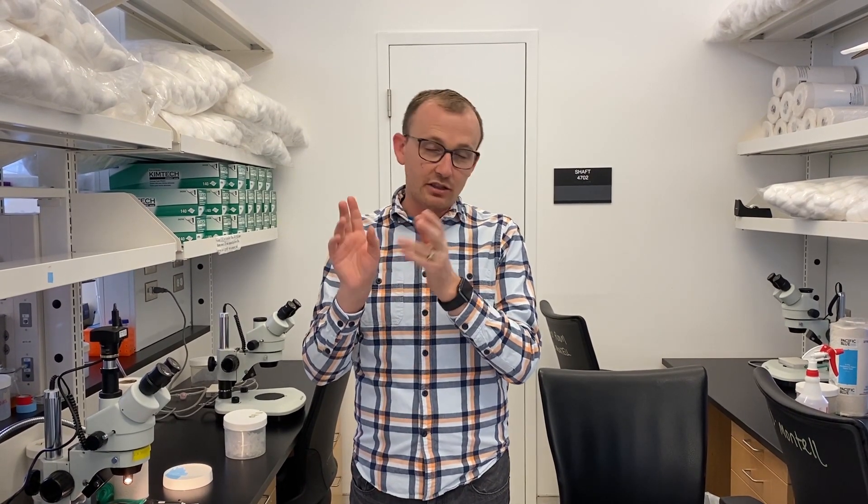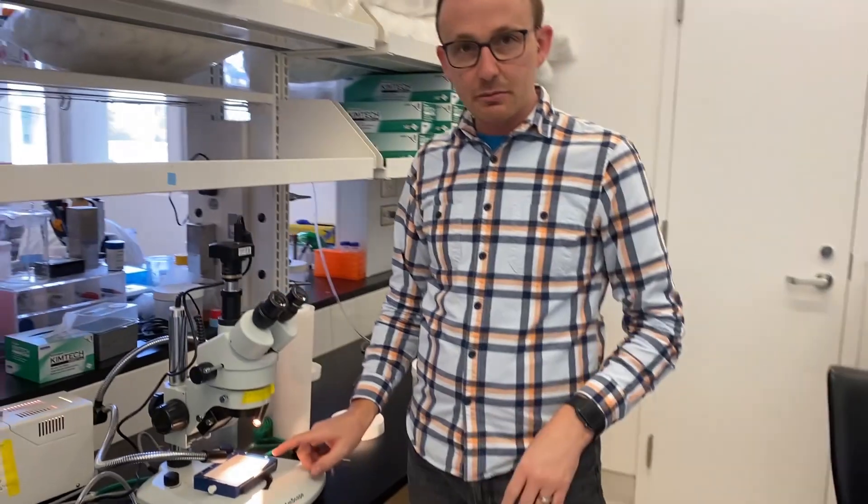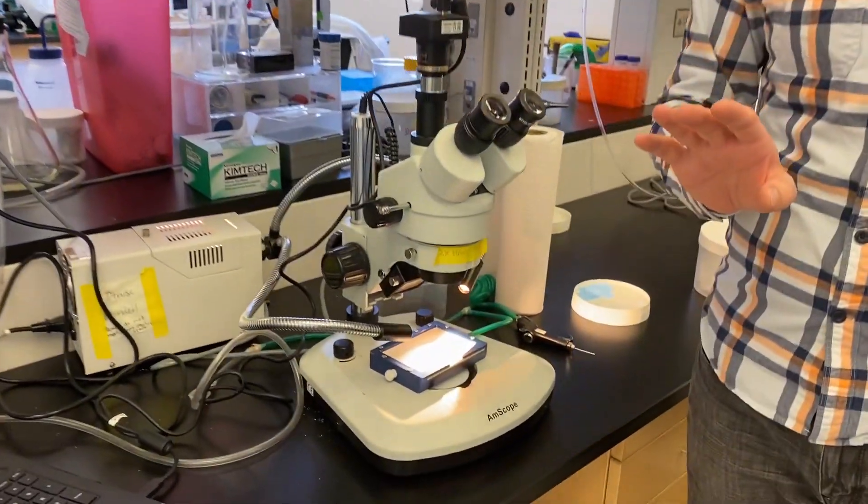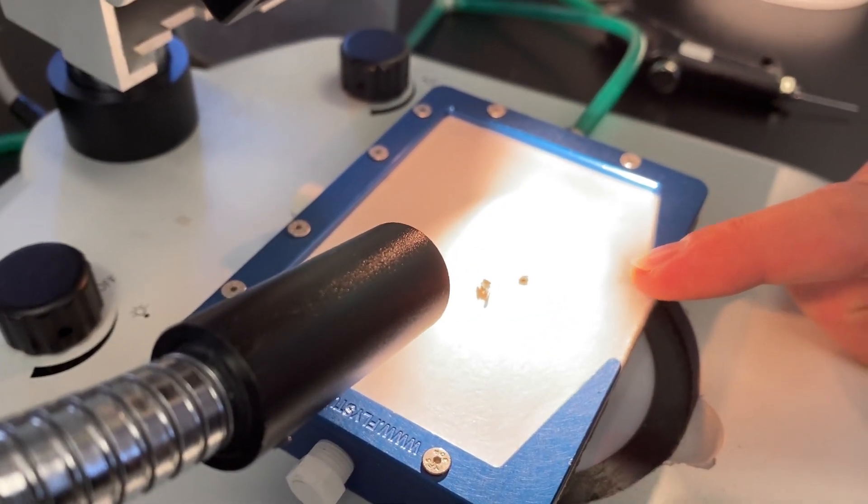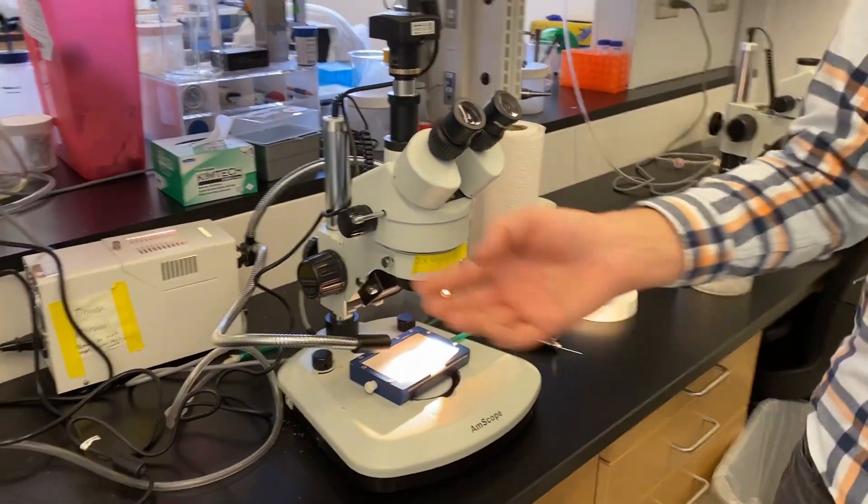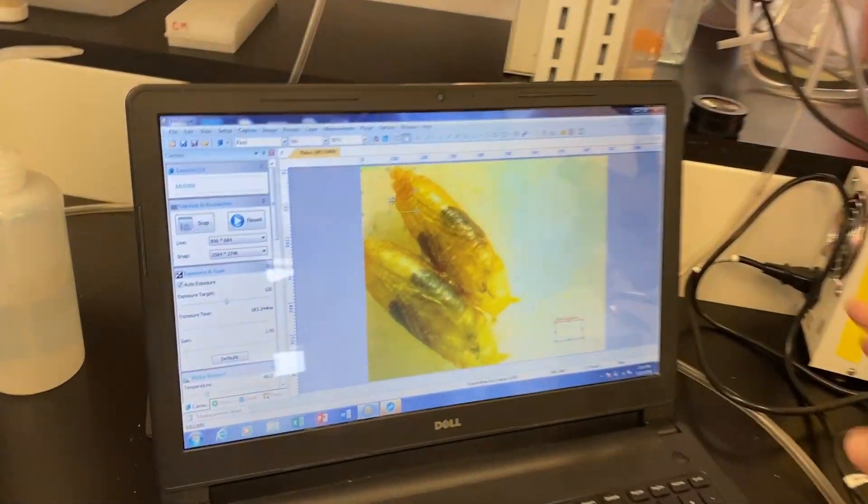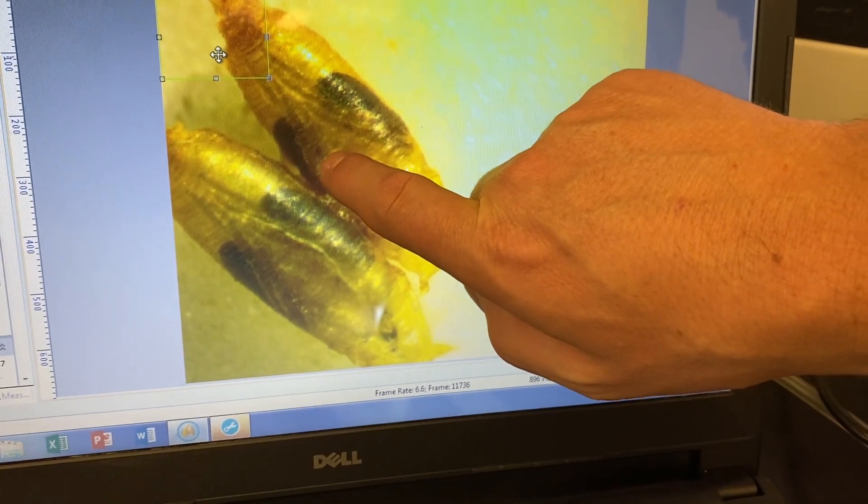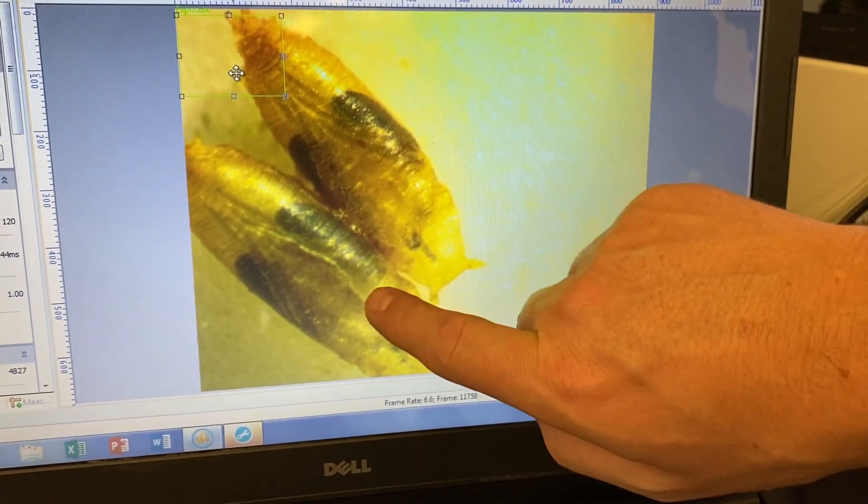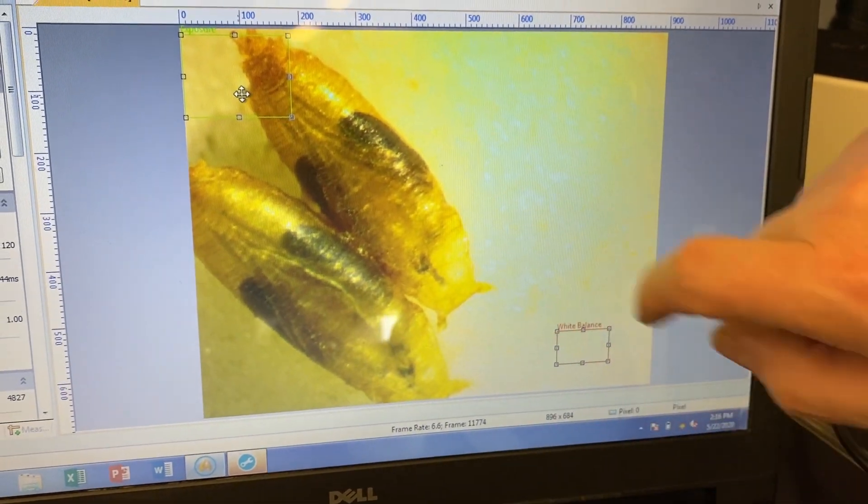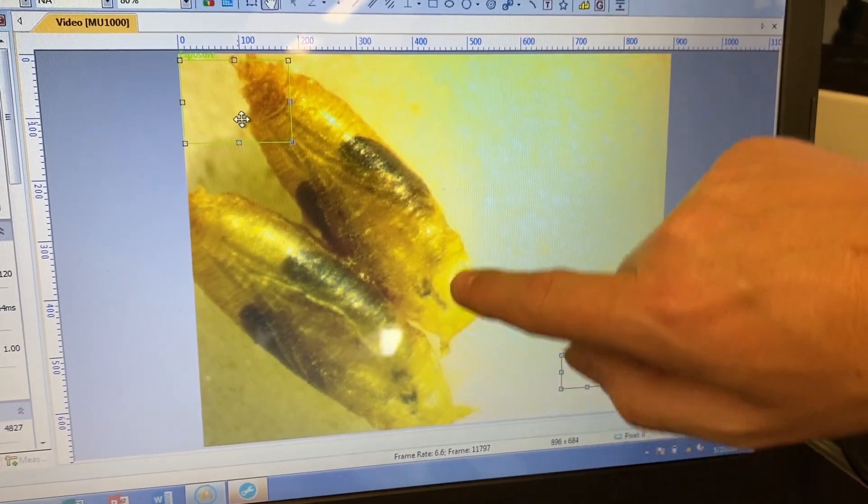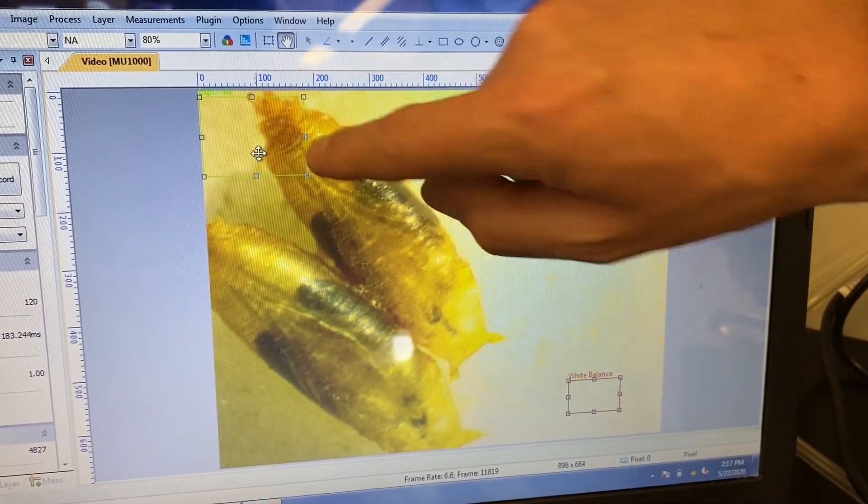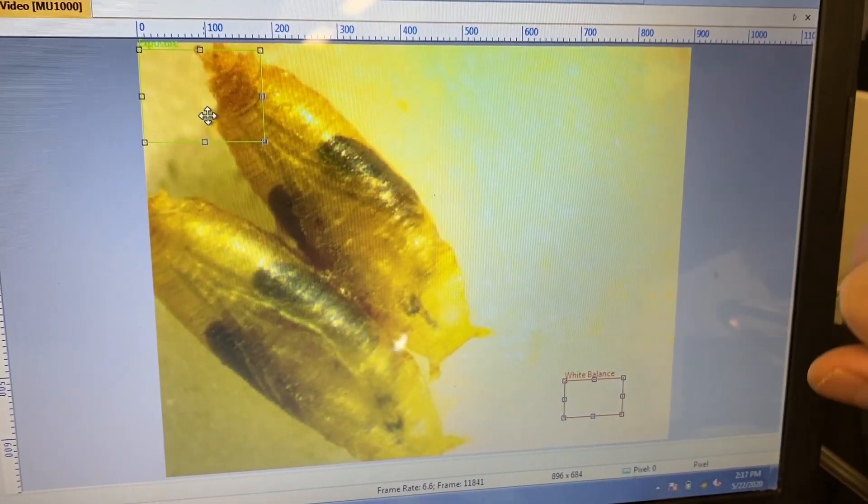Alright. Now that we've taken a look at how to get the pupae out of the vial and then back into new vials, here's what it actually looks like when you're looking under the microscope. Here we have set up on the fly pad, and I must tell you there's no reason to use CO2 at this point, but here we have a collection of pupae on the fly pad for which you would be evaluating and moving them around. We've set up this very basic camera so that you can see we have a male here on the top and a female here on the bottom. And what you're looking for is the sex combs right here that I'm pointing to on the male. And you can see that they are missing from the female down there. So these pupae are facing here so that the head of each pupae is here and then you can see each one of the pairs of legs and then the dark wings that I drew on the board.